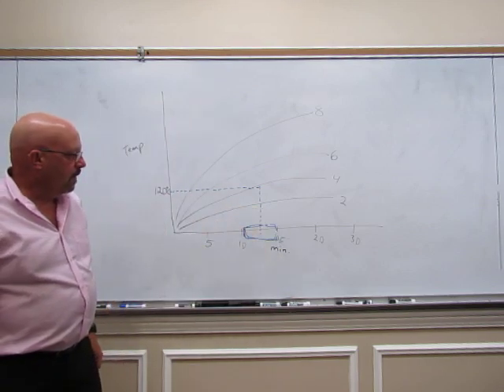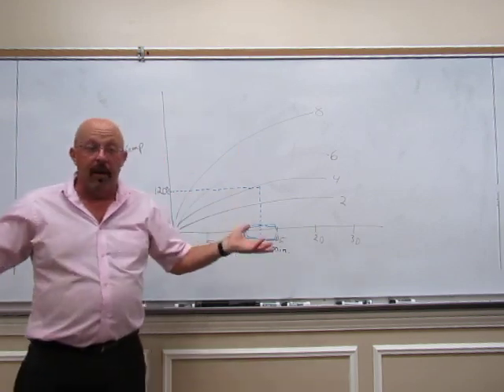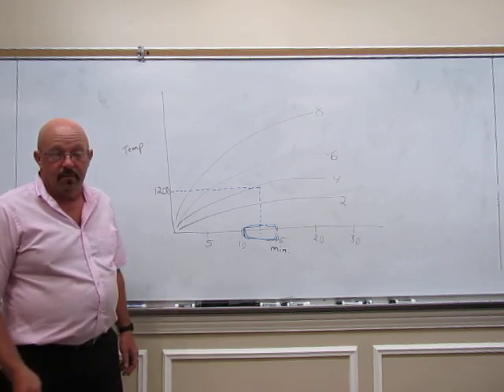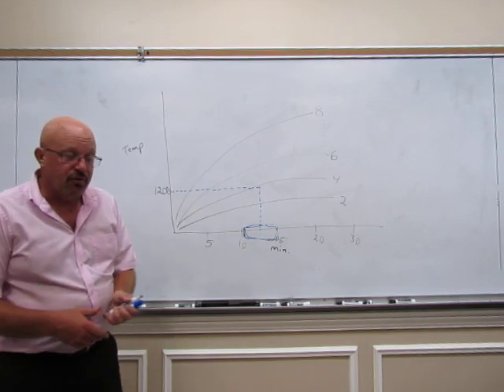You're looking for about 10 to 15, somewhere along in there. Any shorter than that, that's too fast. Any longer than that, you're just here all day. It's nice if you want to wait 30 minutes. That would be fine, but it's just going to take forever. So a good compromise is 10 to 15 minutes. It'll get you a pretty good number.